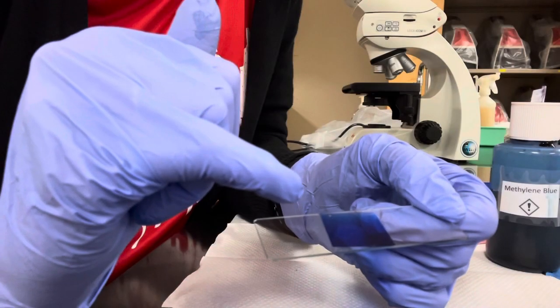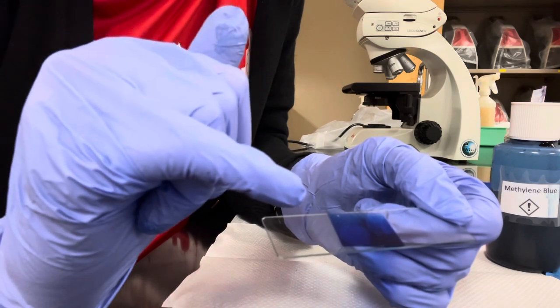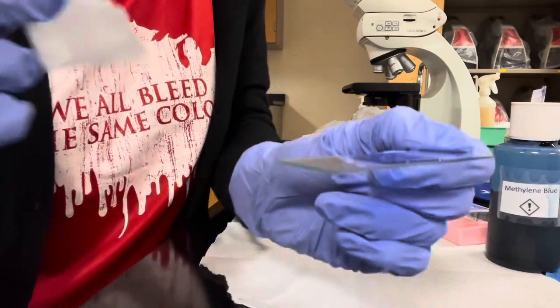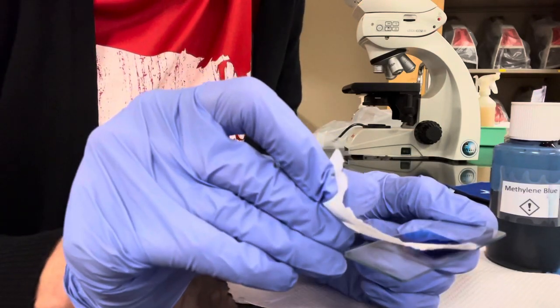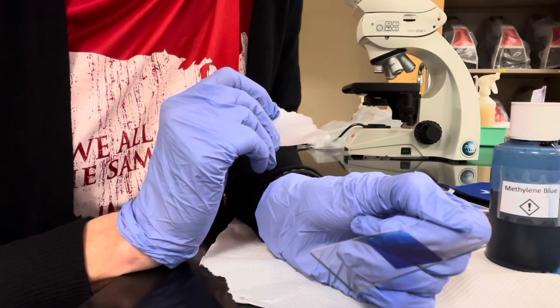Have excess on the sides. If you had a little too much stain, you can go ahead and use the corner of a paper towel and soak up the excess. Then your specimen is ready for viewing.